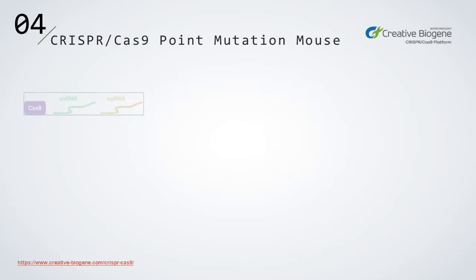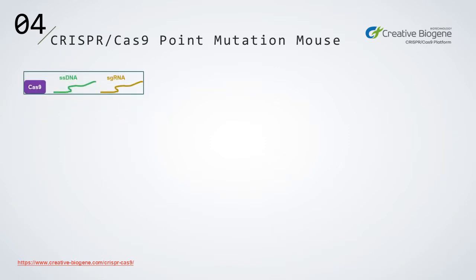In the presence of homologous sequences, nucleotide-directed mutagenesis can be introduced at specific sites in the target gene sequence by the HDR repair pathway, thereby producing a point mutation mouse model. In addition to designing and synthesizing guide RNA and Cas9 mRNA in vitro, it is also necessary to design a homologous DNA sequence with a specific site point mutation.